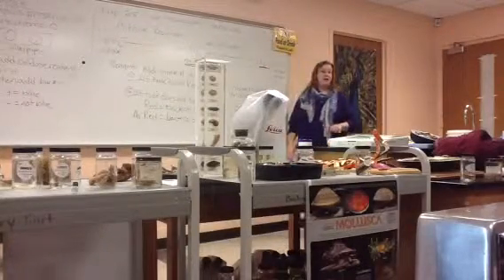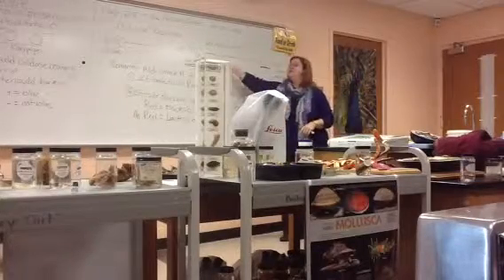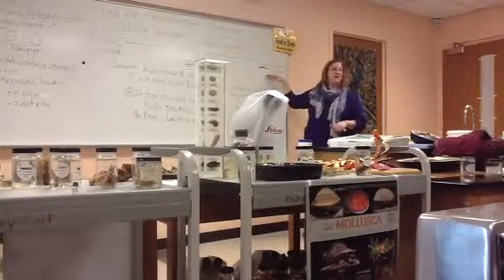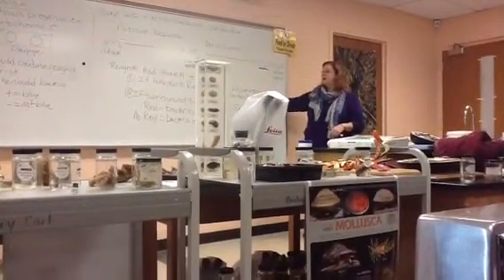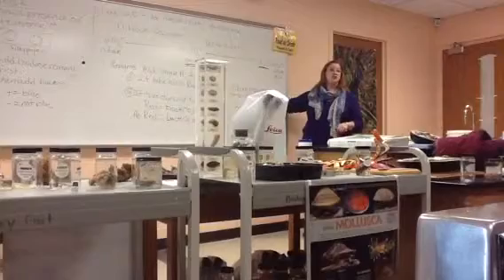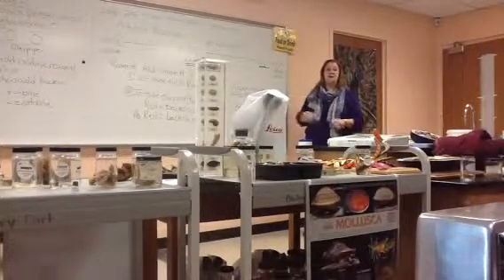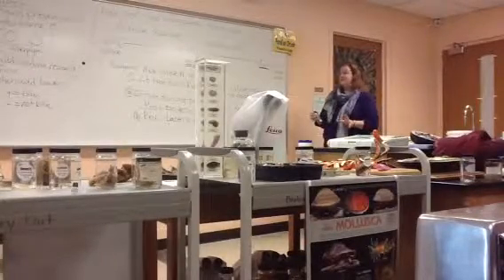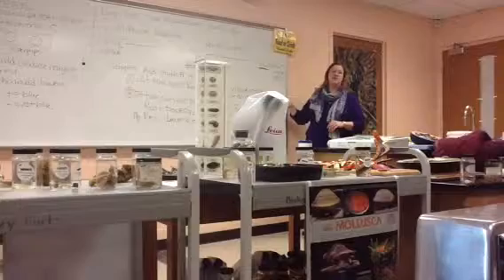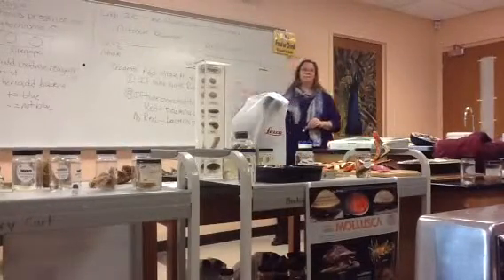They made nitrite, and they stopped right there. Because if they had gone through denitrification, would there be any nitrite left in the tube? No, they wouldn't have turned red. So, positive for nitrate respiration and negative for denitrification if the tube turns red immediately. Add nitrate A and B, turns red, positive for nitrate respiration, negative for denitrification. They stopped right here.